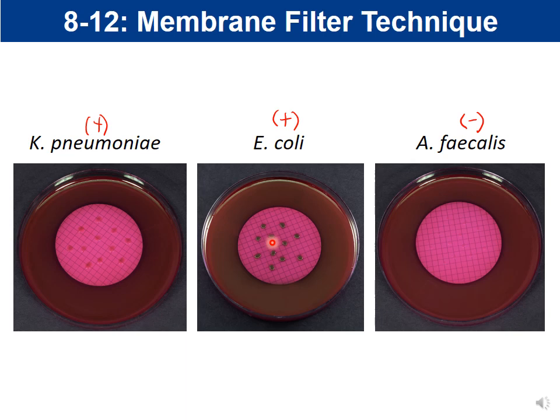Because remember that this media is selective. The only thing that can grow on it is the gram negative. So even if I had gram positive bacteria in that water sample, it's not going to grow on endo agar.